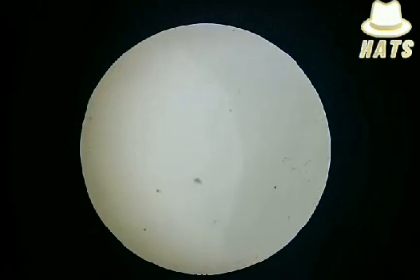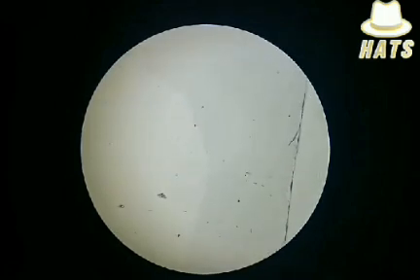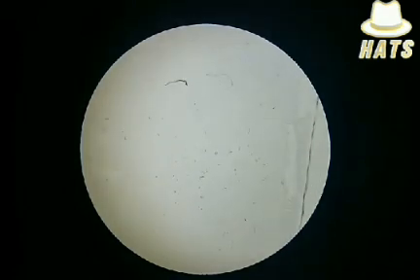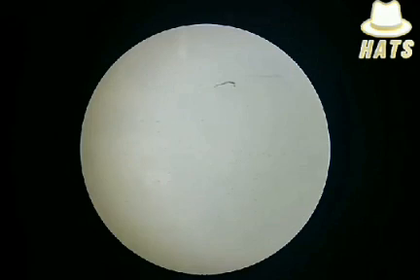Then you start to see immediately some strange things there that should not be there. Gel is transparent; it should be just transparent. You can see some gel under the cover glass, this darker area. The other already evaporated. Well, I don't need to go far.